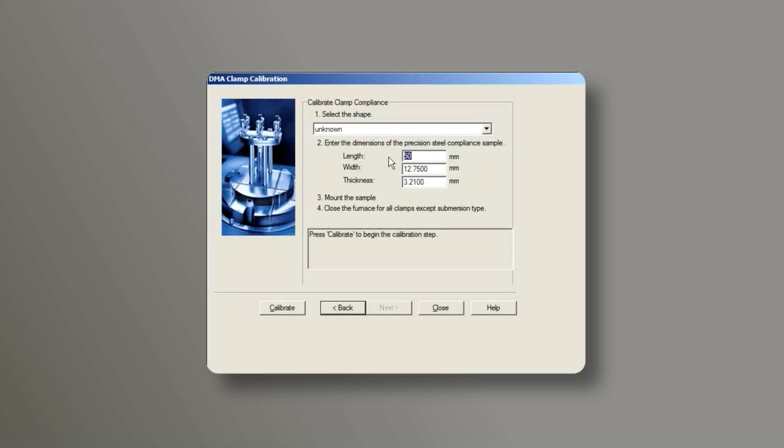From the control software, enter the length, width, and thickness of the steel shim. Then click on Calibrate.